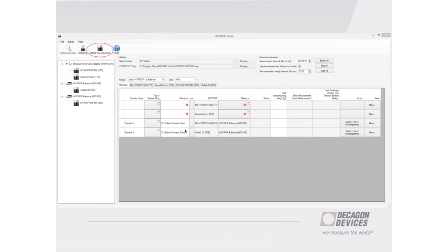Another new feature is offset recalibration. Sometimes HyProps drift from zero due to sediment buildup on the pressure transducers — which can happen if the HyProp isn't cleaned thoroughly before removing the tensiometer shafts. The sediment buildup causes an offset in the zero point for the pressure sensors. Now you can place the HyProp on its side, go into the offset recalibration window, and reset the zero points on the pressure transducers.